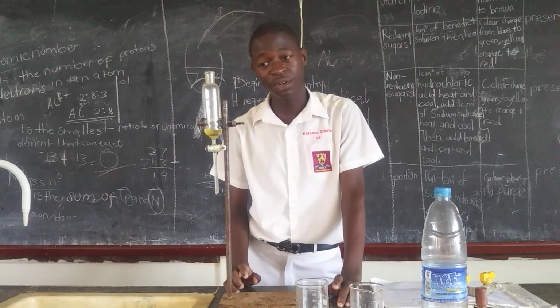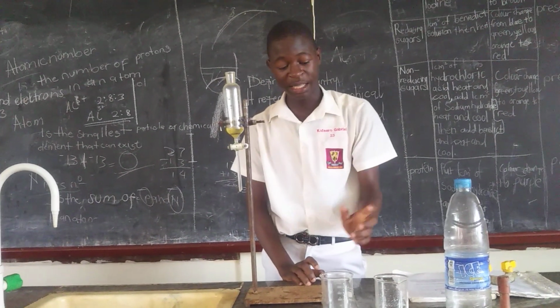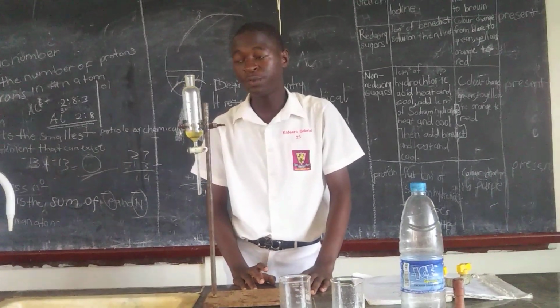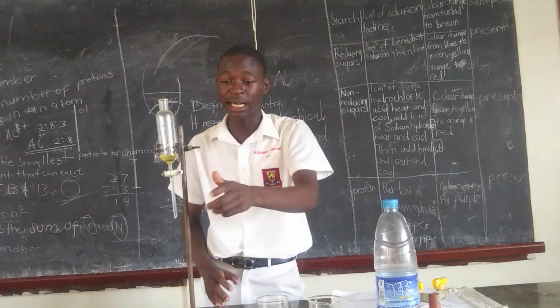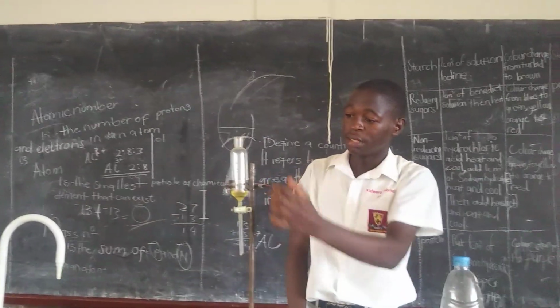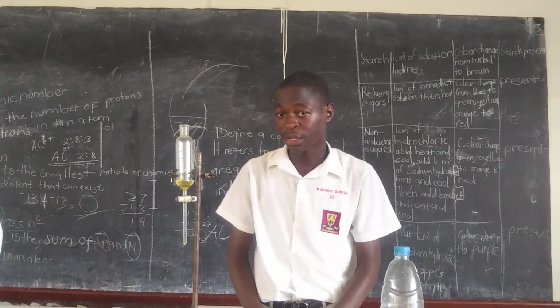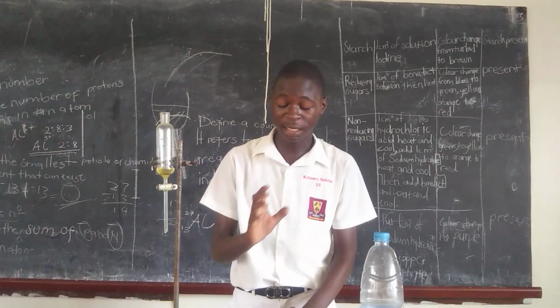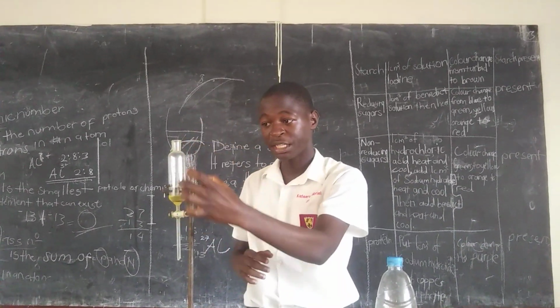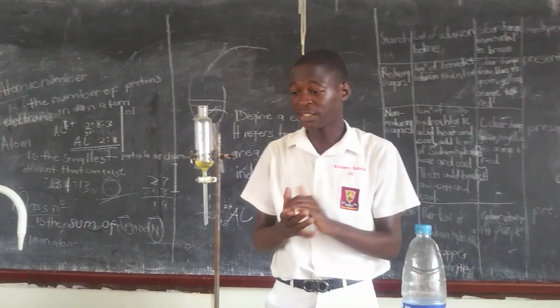What if I begin with the oil and then I pour water, will it separate itself, or do you first need to separate it by turning this funnel? So what I need to do, that's not it. When I'm separating the liquids, any liquid that you first drop in the separating funnel, then you drop another liquid, will still give you the same result.